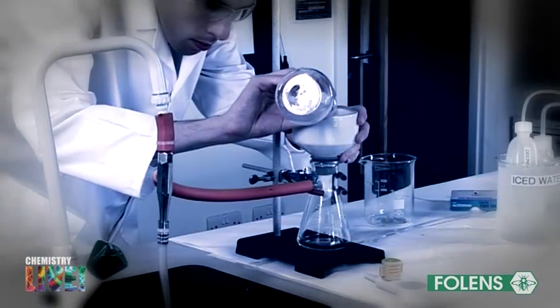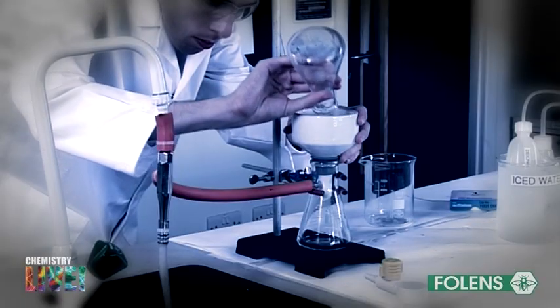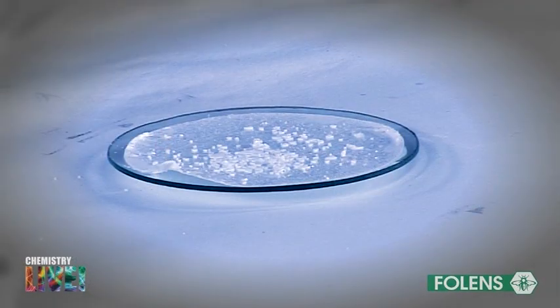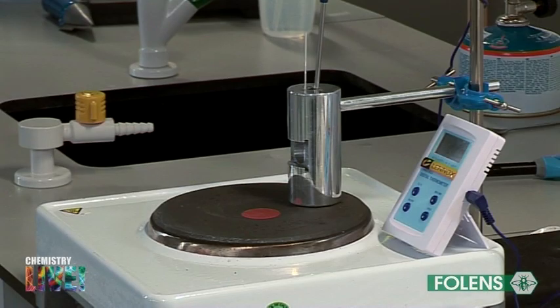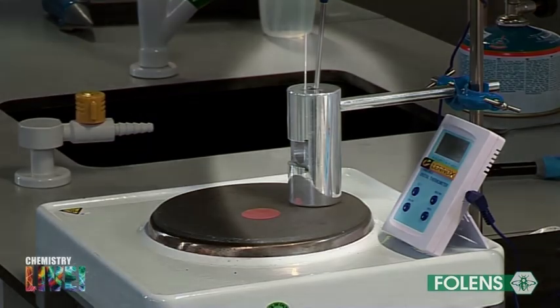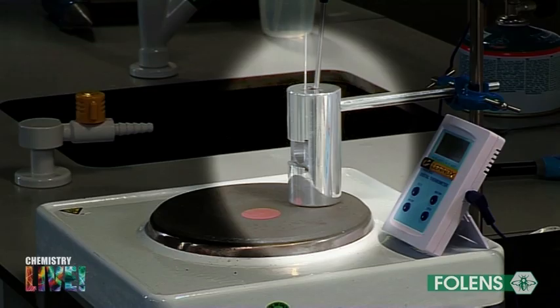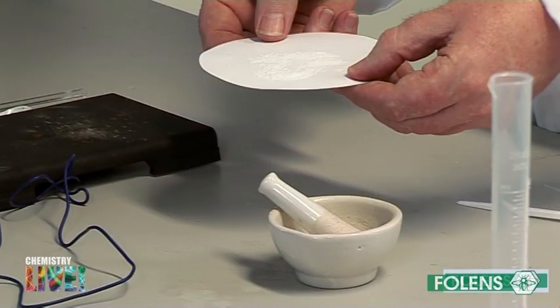In this experiment, we will measure the melting point of the benzoic acid crystals formed in the first half of the experiment. Since the melting point of benzoic acid is greater than 100 degrees Celsius, we use an aluminium melting point block. We had to leave the crystals air dry overnight as an incorrect result would be obtained for the melting point.